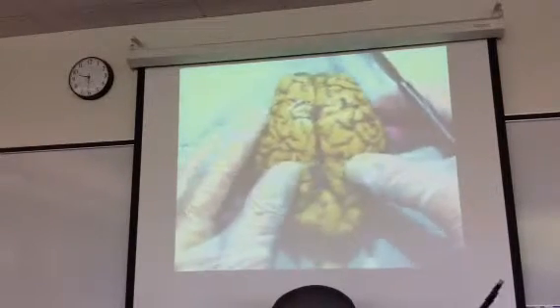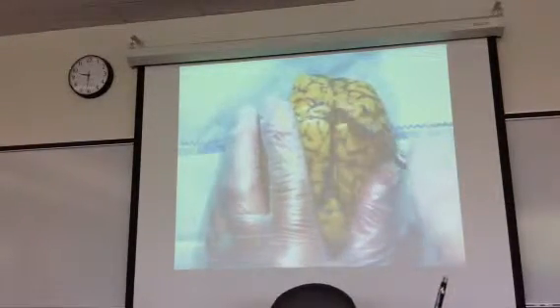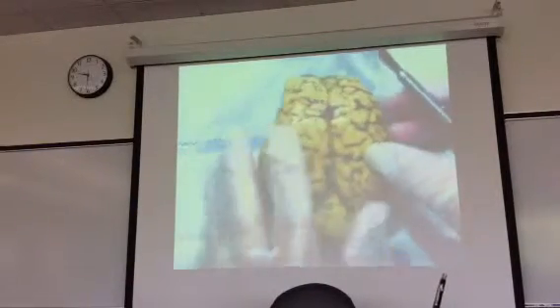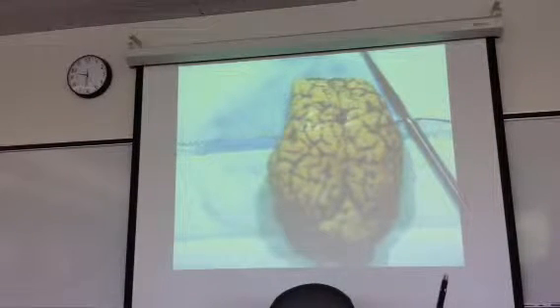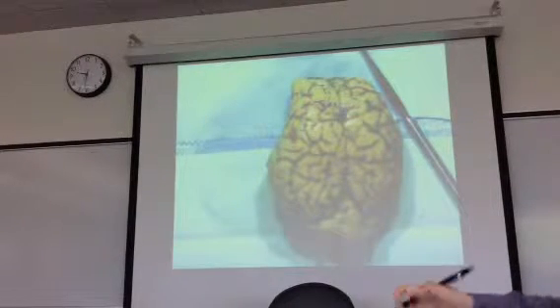See that? That clear stuff is called pia mater. Look down in there, you can see some more breaking. Do you guys see that? We can't split the brain completely in half. This groove, which I just lost a little piece of brain matter. Oops. Okay. This really deep groove that runs mid-sagittally, that's called the longitudinal fissure. It's the fourth bullet point. We had to break through some pia mater to expose that longitudinal fissure.